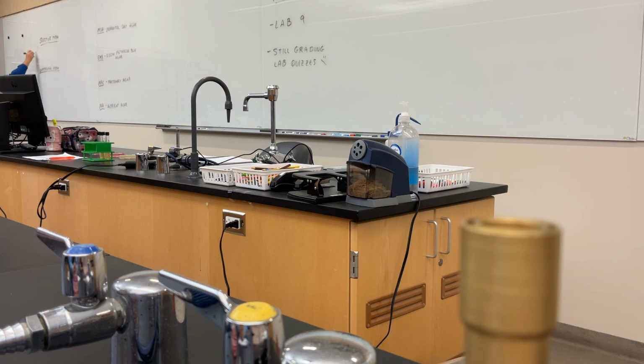Sometimes the same type of media will work together. Sometimes these are combined. What I mean by that is that sometimes we're going to have media that is selective and differential, which is really nice because then they go hand in hand. Selective media means that it's going to have ingredients that only grow target organisms.